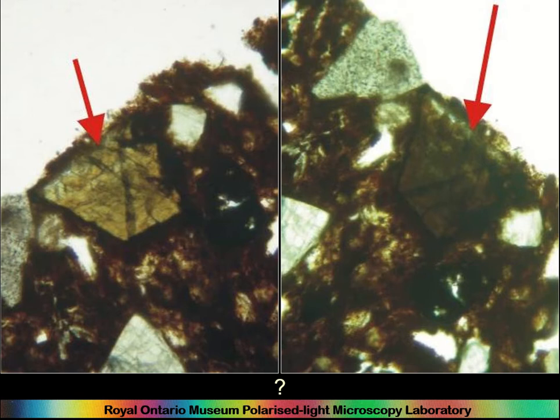So you will describe the inclusions, you will be able to group fabrics, petrofabrics of pottery based on these descriptions of unknown inclusions, and be successful ceramic petrologists, whether you can identify every single mineral in your thin section or not. So describing based on the properties is far more important than actually identifying things. But it's also how do you identify things.